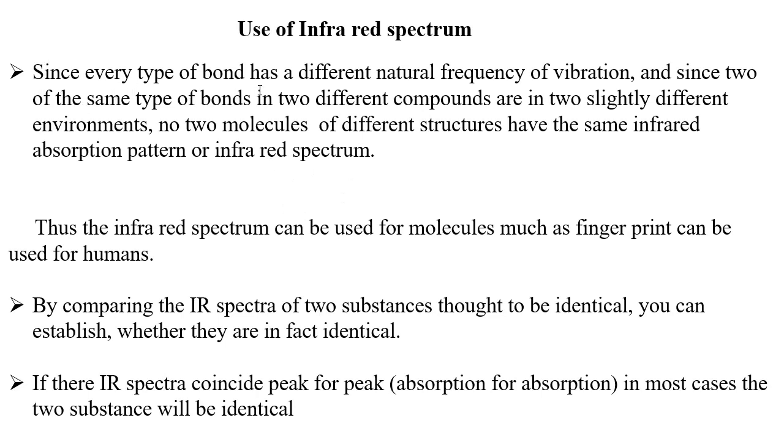Since every type of bond has a different natural frequency of vibration, and since the same type of bonds in two different compounds are in two slightly different environments, no two molecules of different structures have the same infrared absorption pattern or infrared spectrum.